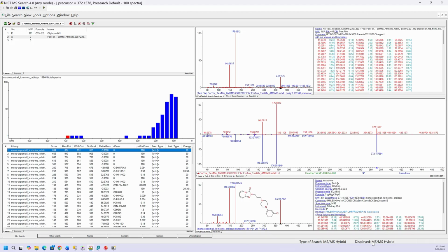And I can't really explain a hybrid. It's somewhat complicated, but it's very, very valuable. You need to learn how to do hybrid searches, and it is imperative that you make sure that your libraries work in hybrid mode because it's so useful. You can look at the bottom, it shows other parameters that are not shown in a standard search. And again, you'll have to study a little bit about hybrid searches. So one last test to make sure everything works.